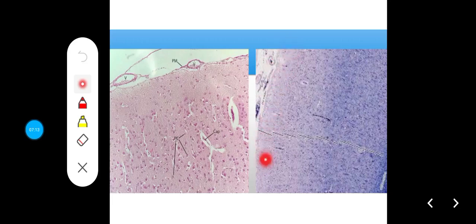It contains majorly cell processes, with a few scattered neurons. Now, the deeper layers contain more of the black dots.